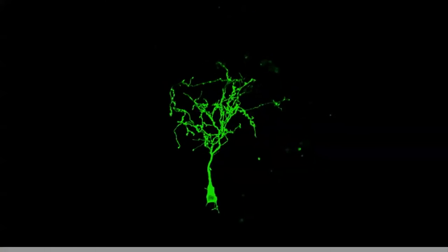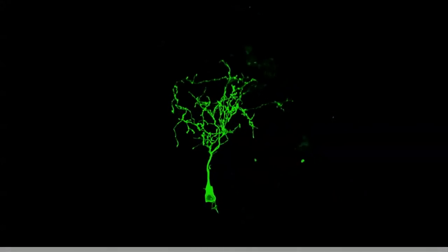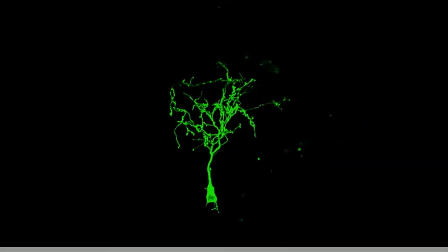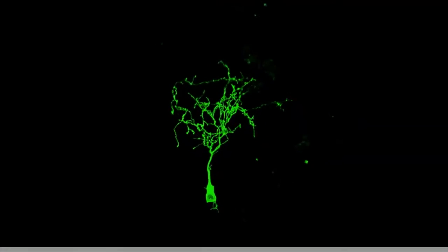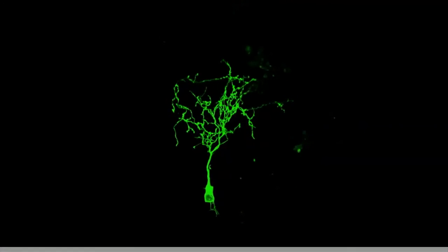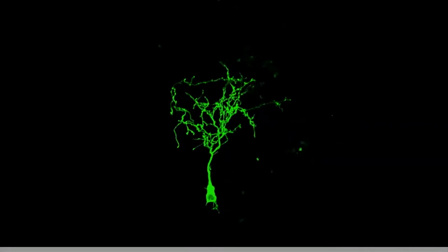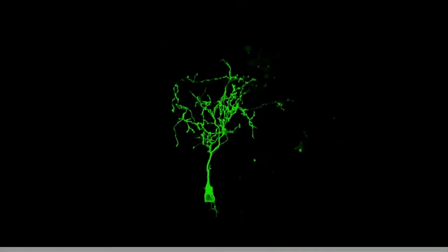So for example, a single brain cell early on in development, like the ones that we image in our lab, has massive amounts of structural change. This is a time-lapse image of a single neuron labeled with GFP, and the time interval is 5 minutes between volumes. You can see within minutes that parts of the arbor have extended, retracted, there are new protrusions occurring. And if you want to measure the neuronal activity in these dynamic structures, you have to be updating your regions of interest very, very quickly to use these fast forms of two-photon microscopy to get the neuronal activity.